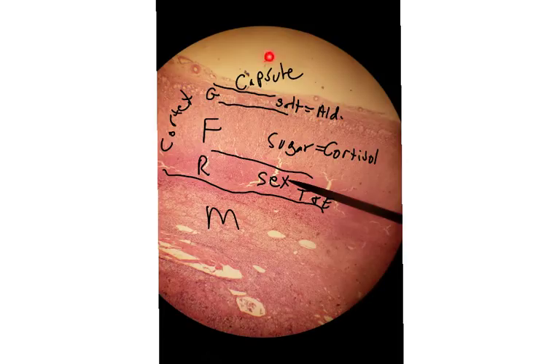So, there's really a lot going on on this slide. But, break it down. Find the capsule on the outside. The medulla, really obvious on the inside. And then in the middle, we've got the cortex. And you can see they are obviously quite different. Just know them in order. GFR, salt sugar sex. Once you've got that down, then use your chart to think about what are some of the disorders associated with hyper or hyposecretion. What is the stimulus associated with release of these hormones? We can really get a lot from that one chart. I hope this helped. And I will have another slideshow soon with the reproductive slides.